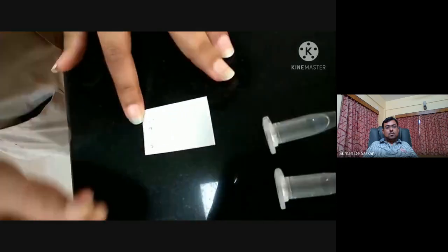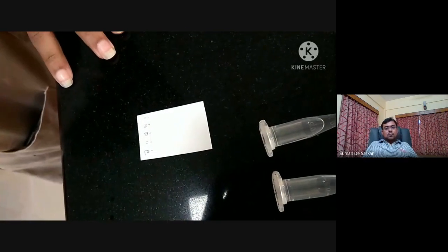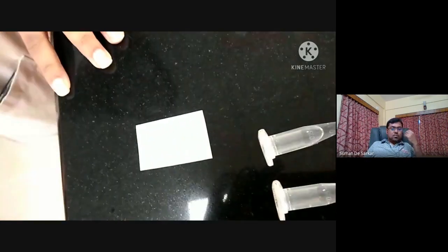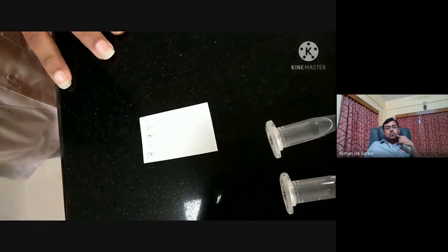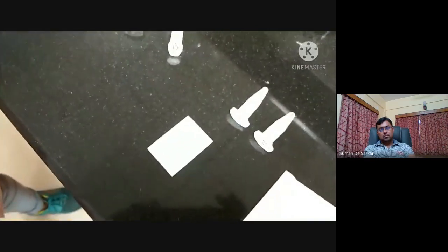Yeah, show it again. Yeah, in that spot. Just touch it, so that a little amount goes there. It should not be too much, should not be too little. It's just the optimum amount that comes from experience. Just for your knowledge, put the optimum amount so that the spot is not too large. It should be a decent circle of 1 to 1.5 millimeter. We continue the same thing for the other solutions as well.